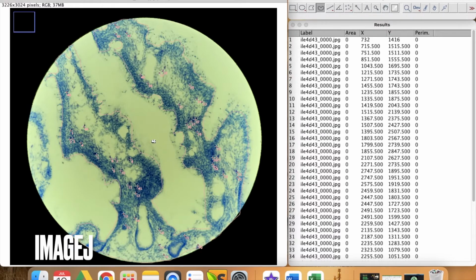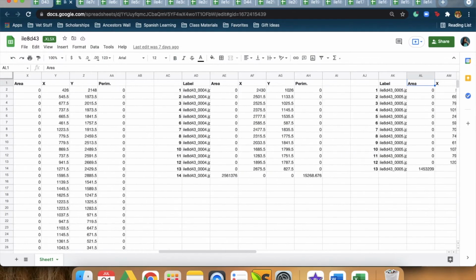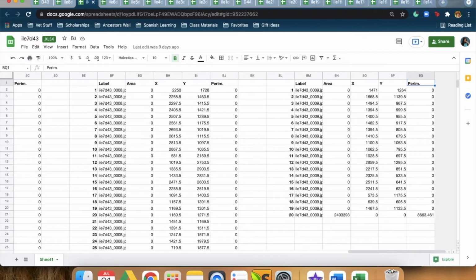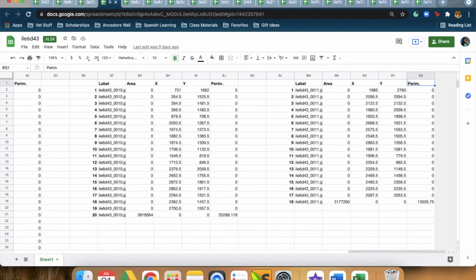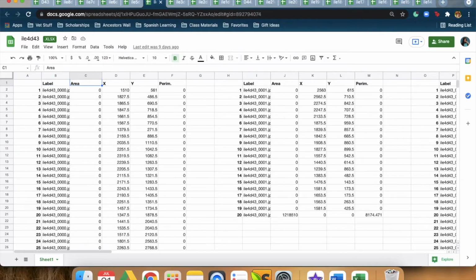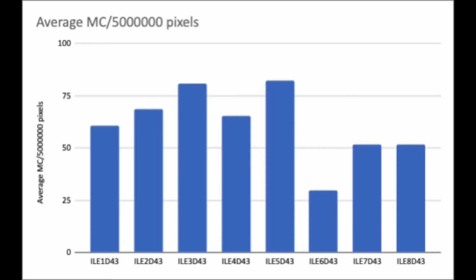After looking at the data from the ileum section of the small intestine, specifically focused on days 43 and 44 of the experiment from 16 birds overall, having taken 10 images per bird, totaling 160 images, and quantifying hundreds of mast cells from these images, so far, the results are as follows. On average, the delay-fed chickens exhibited a greater amount of mast cells than did the normal-fed chickens. Thus, this agrees with our hypothesis, which is very promising, but we are far from done.